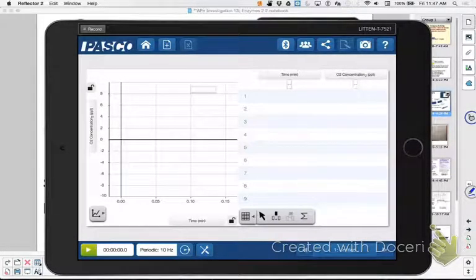Okay, so did I set everything up? Yeah, I feel good about it. Okay, now the next thing I need to do is start the readings. The green button right here, what do you think that means intuitively? Play. Okay, so what did I put in here just a little bit ago? Hydrogen peroxide. So now I'm going to add in how much catalase? 0.5.